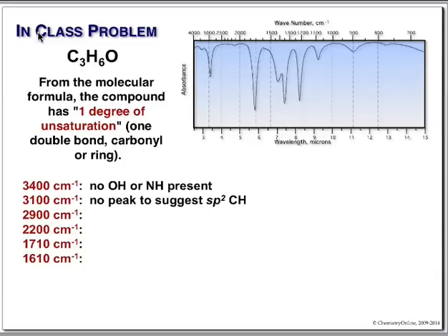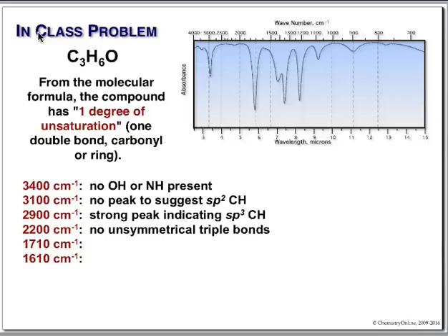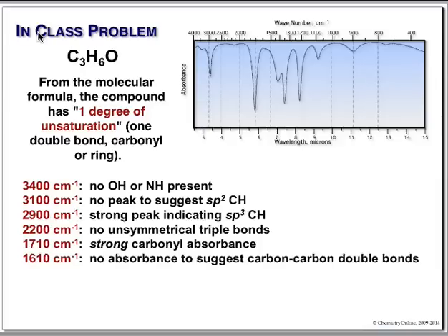2900, so on the low side of 3000, we get a nice peak there, saturated or sp3 CH. We don't see anything in our 2750 area. I didn't put that on the list. On an exam, you could. That would be a good thing to do. Next thing we would do is we would hit our triple bond region. There's nothing to indicate an unsymmetrical triple bond. Carbonyl, big, broad peak right here at 1700 or so. This compound has a carbonyl. Finally, 1610, right here. We see nothing to suggest a carbon-carbon double bond.